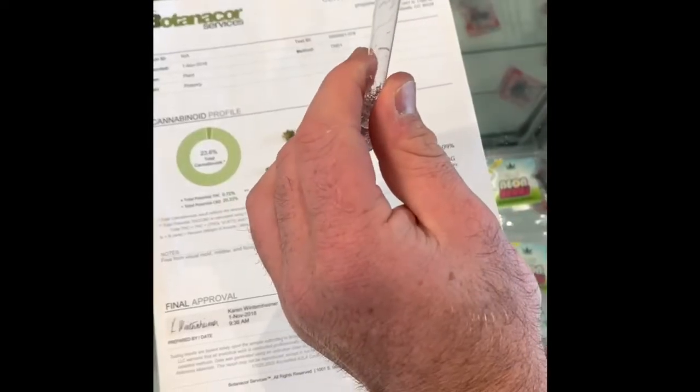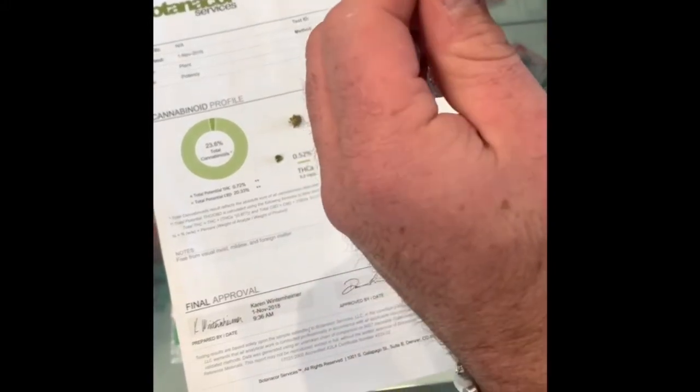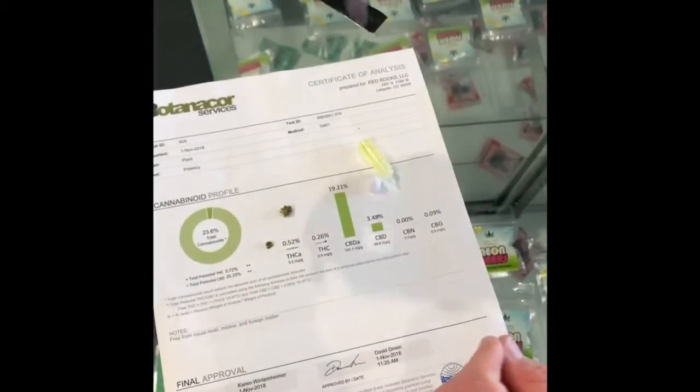I'm gonna put some drops of this in here. I got chocolate. Okay. And then close this, break that, mixing it up. And we're trying to get that purple reaction already.